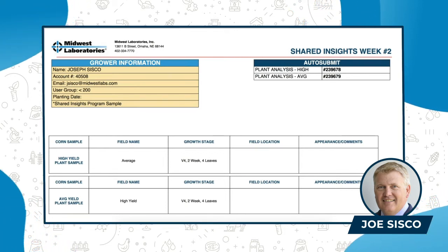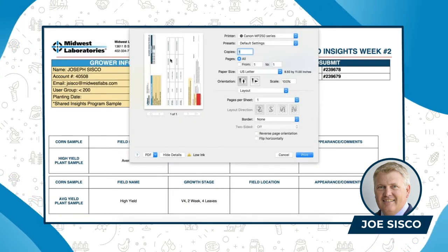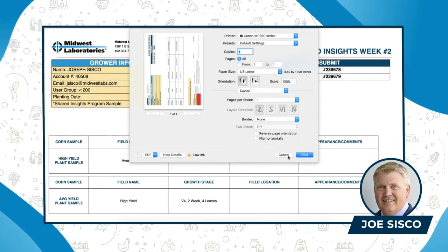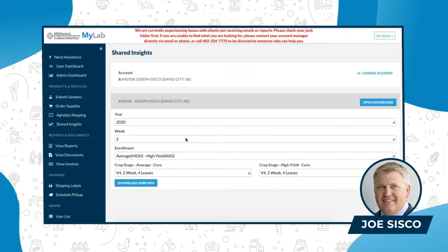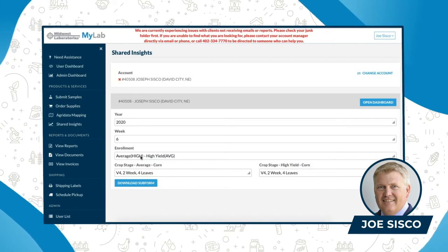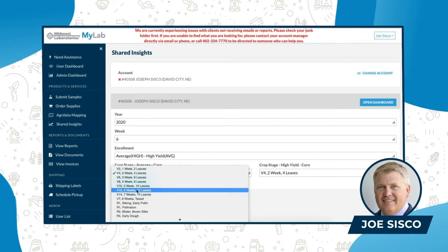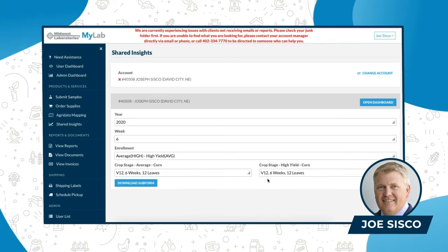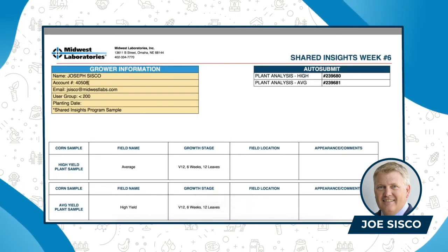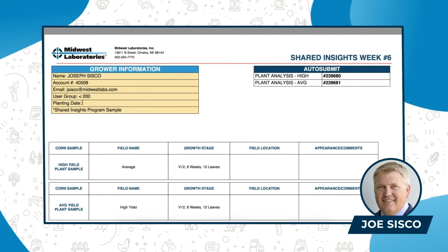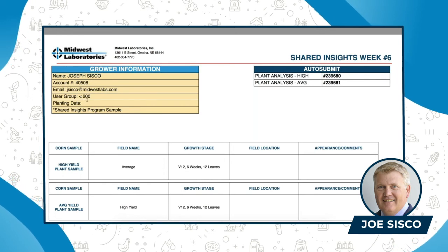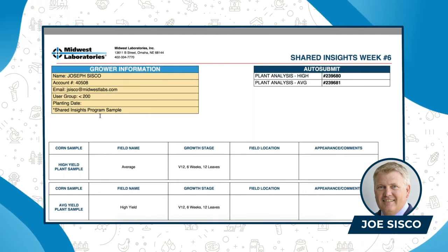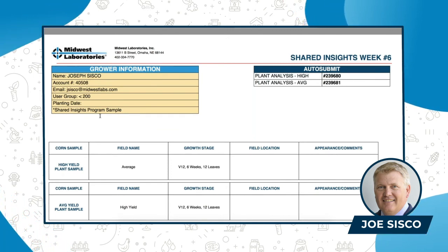You can put in a note once you print it — right here — that we'll read at the lab and make notations on your account, including field location or appearance comments. You'll progress through this all the way through week six, where you're actually at V12. You'll change that growth stage according to what your crop is. Download the sub form and check everything: the grower information, your account number, your email, your user group, whether you're more or less than 200 bushels per acre, the planting date, and that it's specifically the Shared Insights program. This is the auto-submit paperwork we need to get your soil and plant tissue samples into our lab correctly.